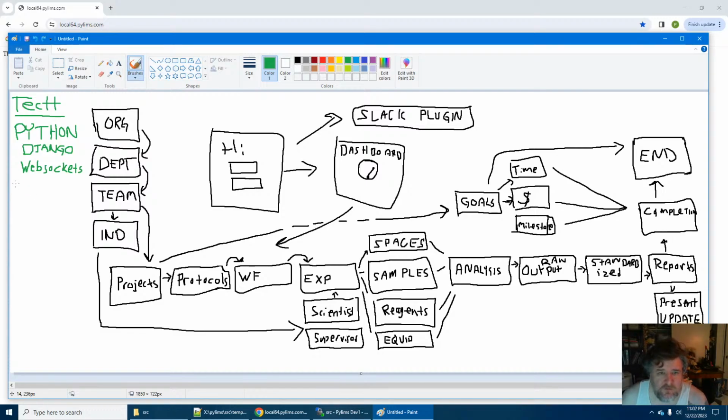Oh, let's see. I think that's how you spell that. So it'll be on Ubuntu. We're using Python. Oh, I am developing on 3.12, which at this time is the most current version. These WebSockets.